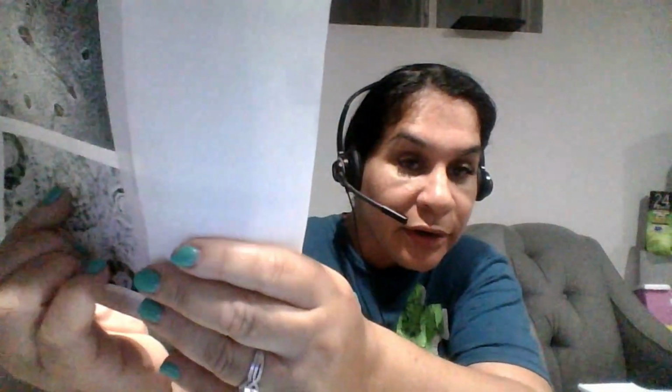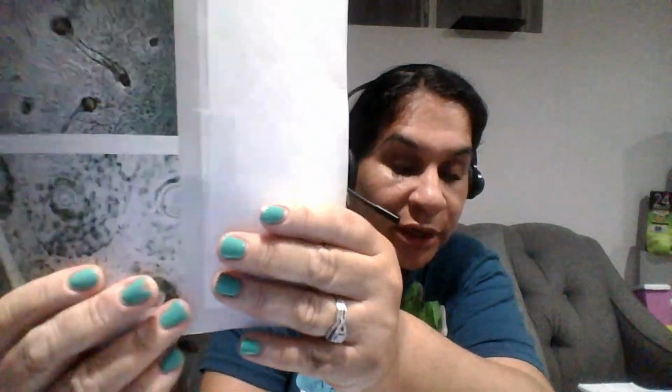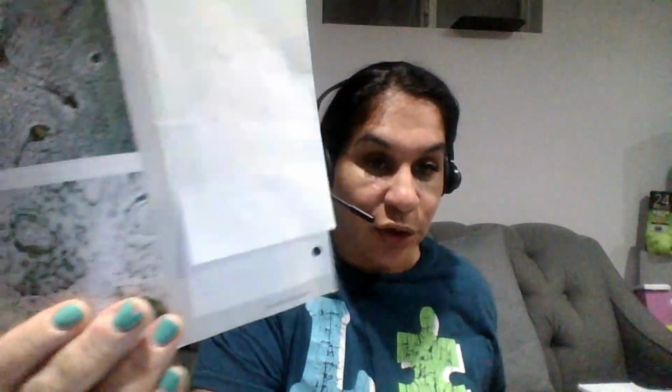Okay, bone. This is bone right here. These are osteocytes. In the middle here are central canals. Those are where the arteries and the veins are. This one is found in bone. It's attached to muscle. It protects internal organs, like the skull protects the brain and the vertebrae protect the spinal cord. It also stores excess calcium and protects red bone marrow.